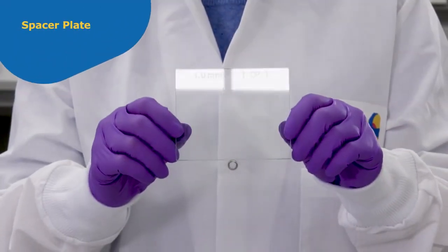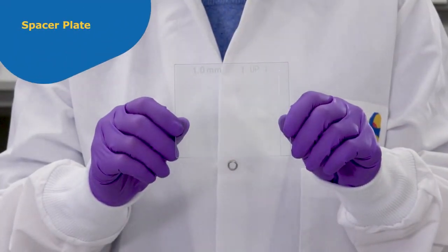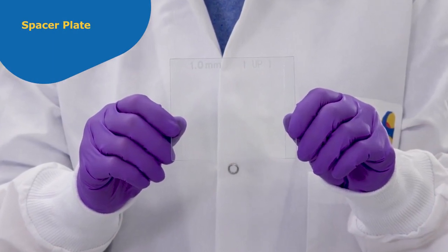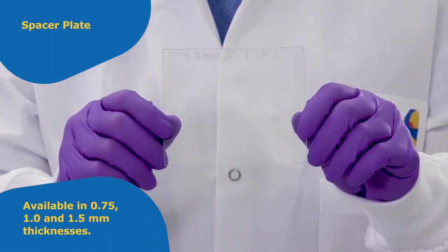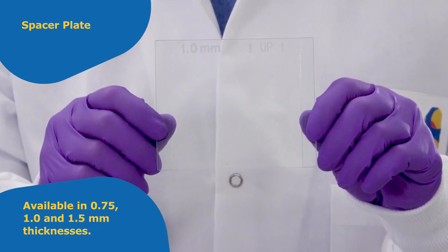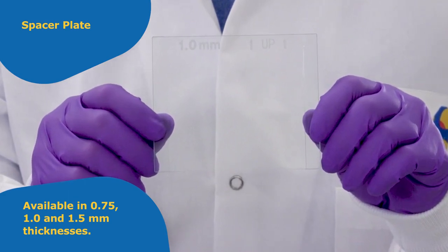The spacer plates are tall glass plates with integrated spacers that determine the thickness of the gel. Spacer plates are available in 0.75, 1.0, and 1.5 millimeter thicknesses.